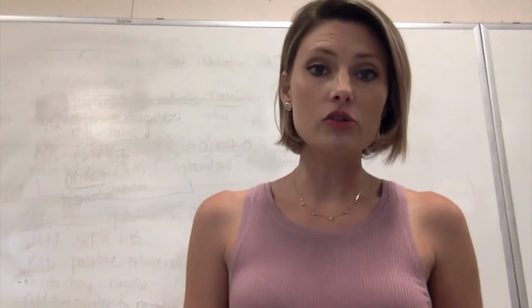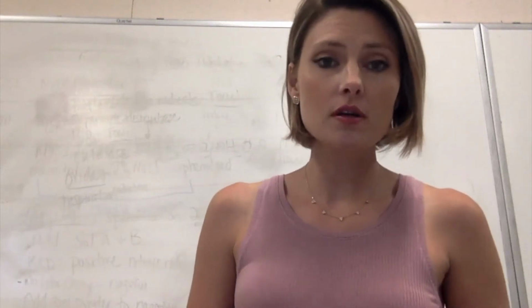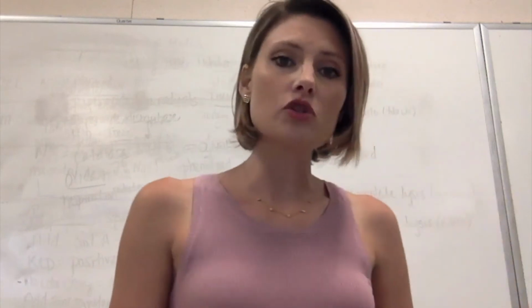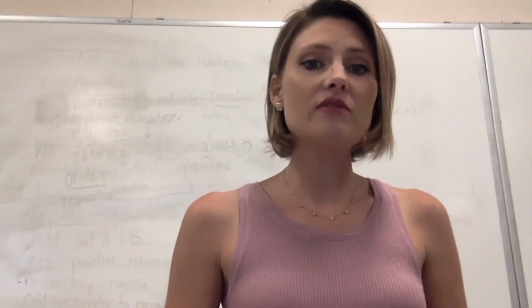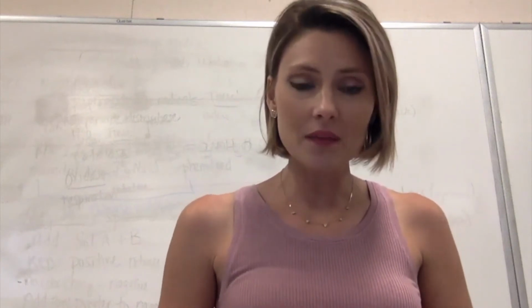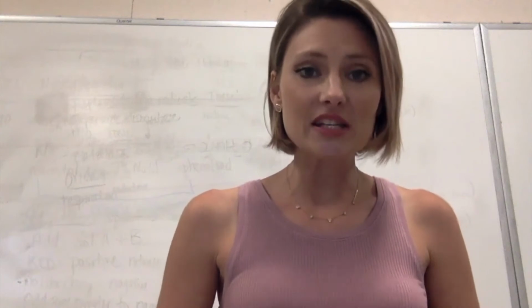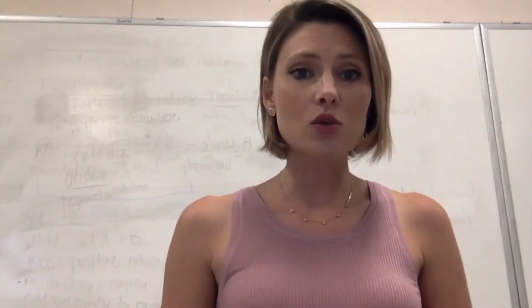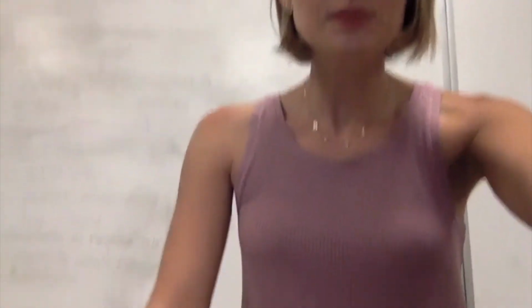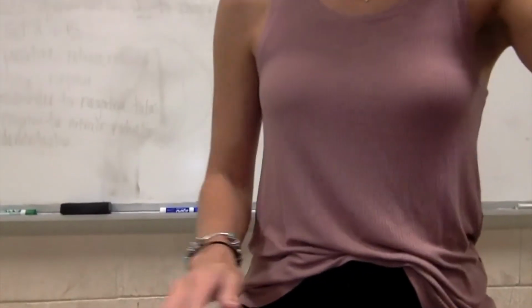So I am back with the results for your first selective and differential media. So we're going to start out by reading the results of the gelatin plates. Remember, that was the very first one on the list of the media. And remember, it is a strictly differential media, and we are looking to see, can the bacteria eat the gelatin, yes or no?